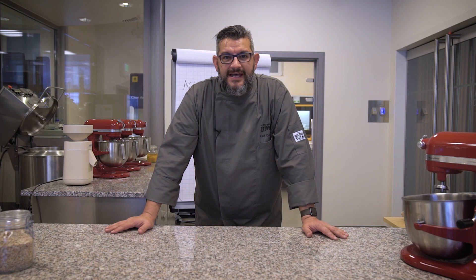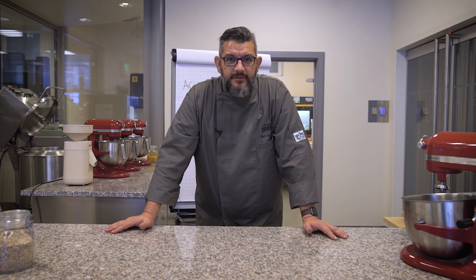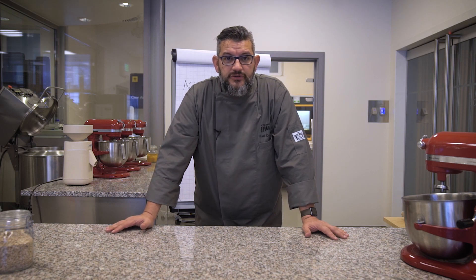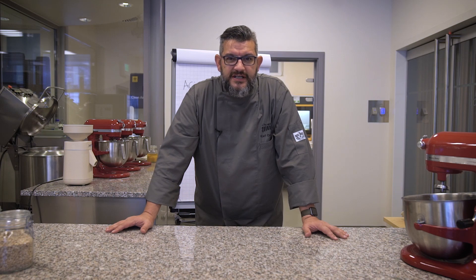Let's talk about acidity. In sourdough there are two measuring points. You can measure the pH and therefore you need a pH probe, but there is also the Total Titratable Acidity, and unfortunately for that you need some gear.